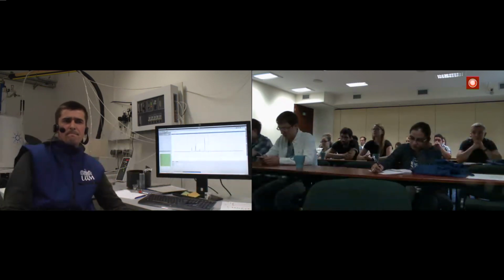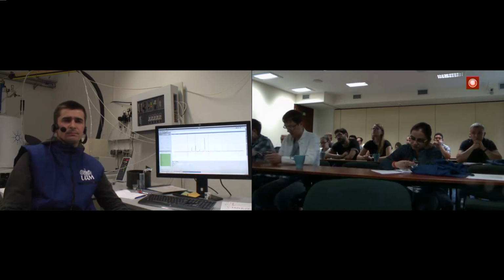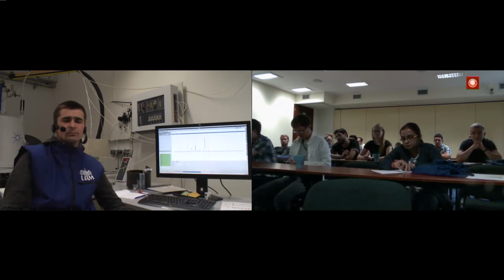This is not like in the high resolution spectrum, because in high resolution spectra the relaxation times are also sometimes different, but usually they are very short in comparison to solid-state systems. The third one is that dipolar interactions also change the relaxation and the process of equalizing states.